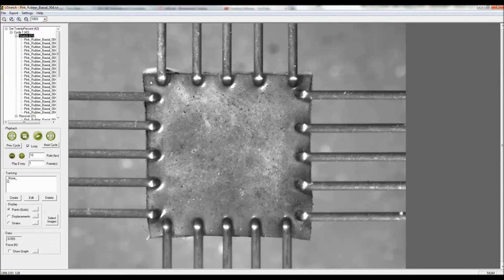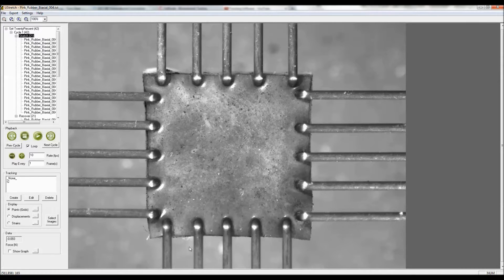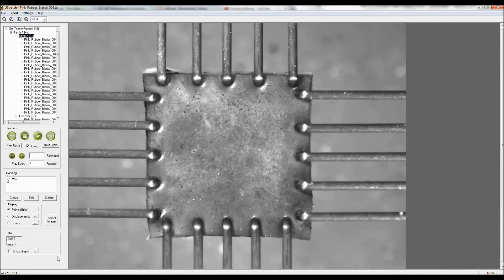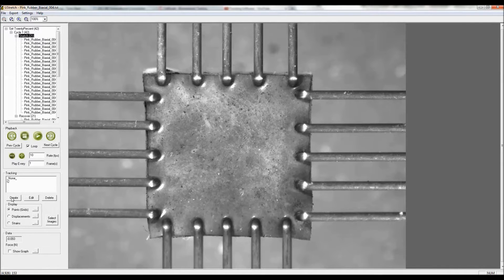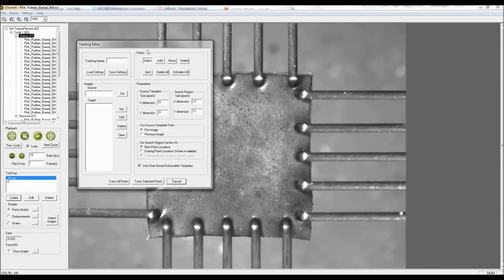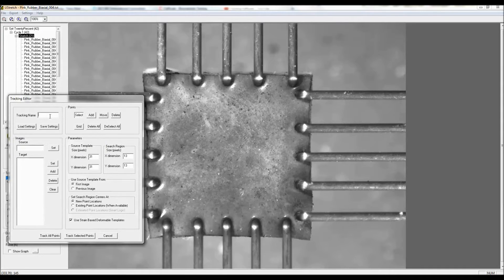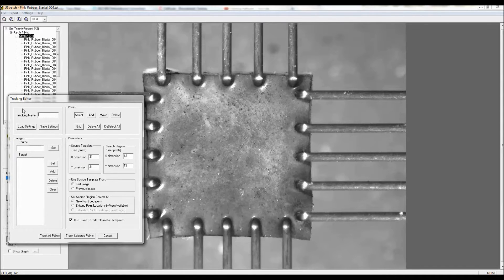The surface of this rubber was speckled with some graphite powder, which is a common technique used to provide some texture to the surface of the specimen to aid in the tracking procedure. What I'm going to do first is create a track set where I'm going to track just some specific points that I select.